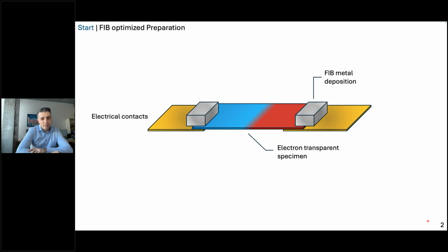And in the end, the only solution was to get rid of the membrane. So this is the first part, more like focusing on what mistakes you should not make doing biasing experiments. Now we can go to the instrumentational part and the method part.